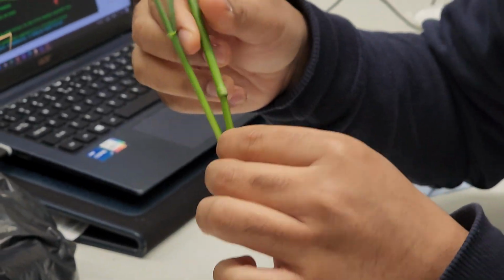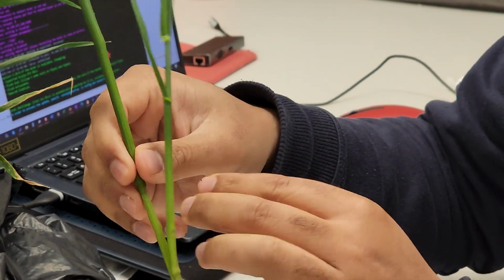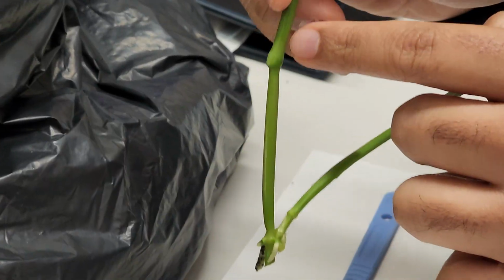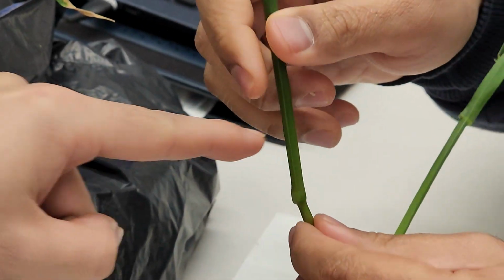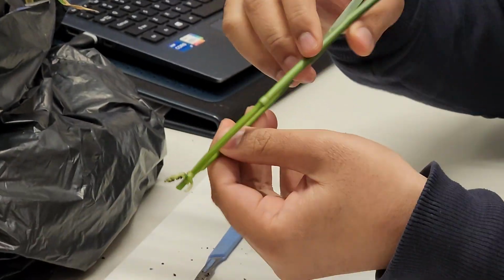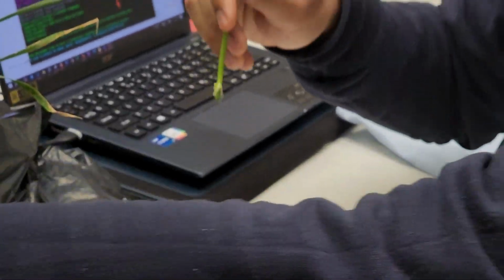Like this guy here. Do you think the meristem is in this internode region, or is it in here? Right. Should be in there, right? So we're not going to cut all the way from the bottom. You know what? Let me remove that. One more.